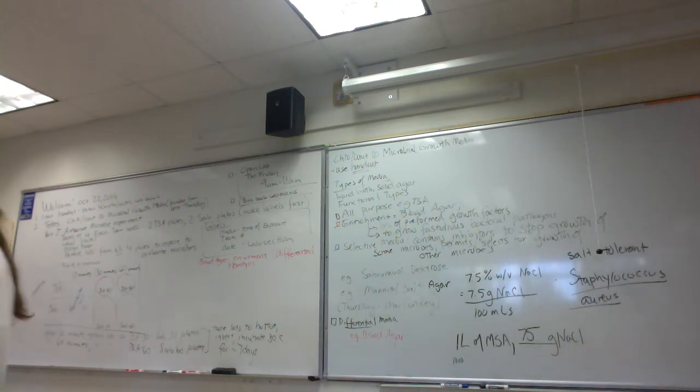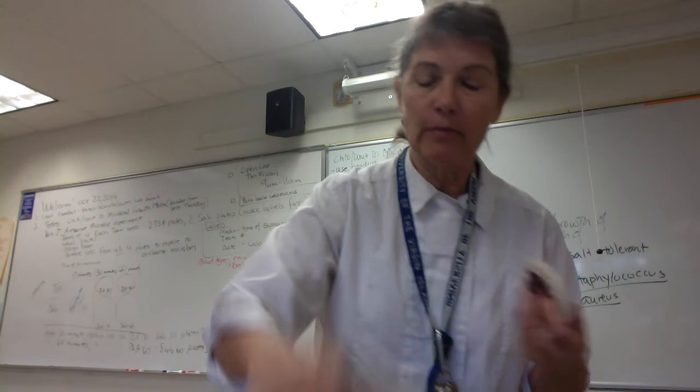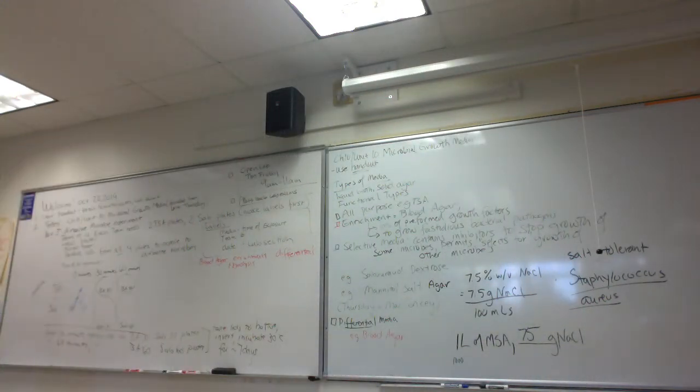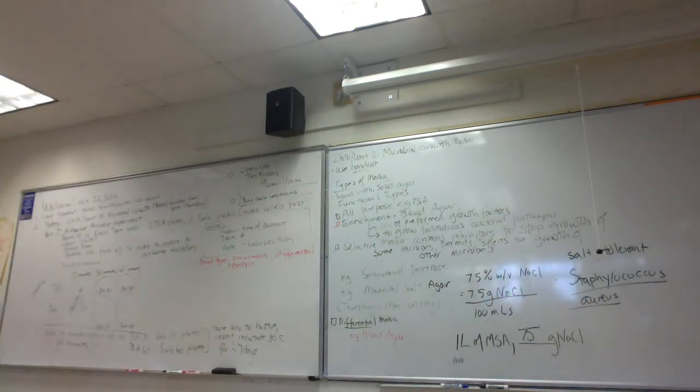Blood agar is so much fun, you guys. We'll do the same thing today. We'll ask for 4 volunteers. You see, you guys, this is the fresh blood agar. This is after incubation with throat and nasal swabs. Do you see a difference in coloration of the agar? Yeah, so this is the hemolysis we're talking about.